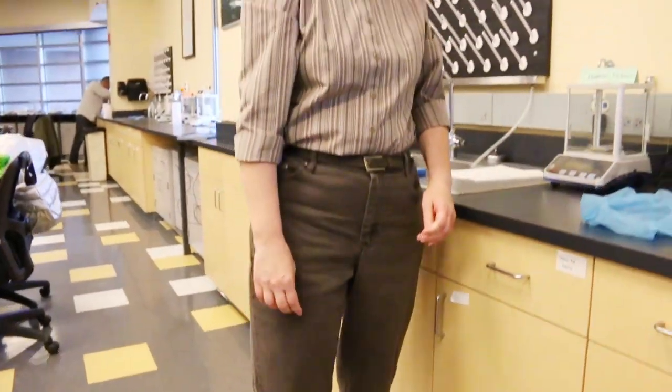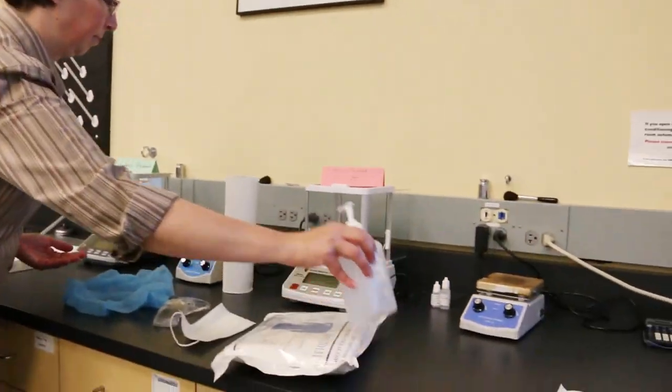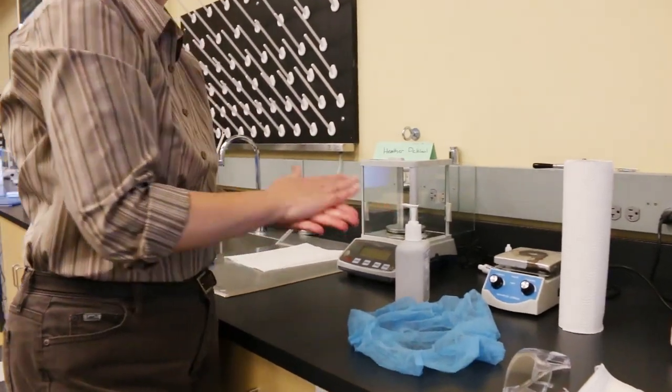Step 5 is to reapply sterile, foamed, 70% isopropyl alcohol to your hands and allow that to dry.